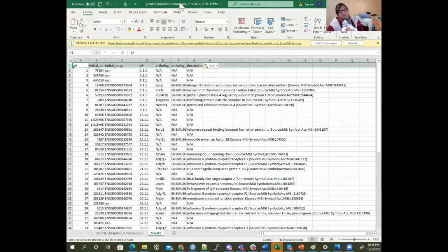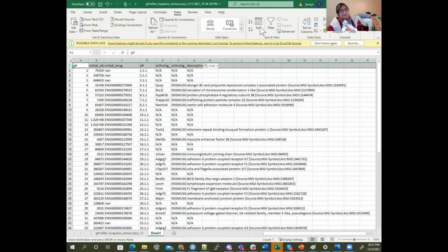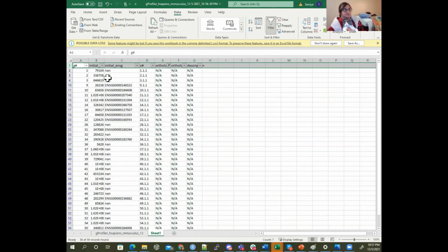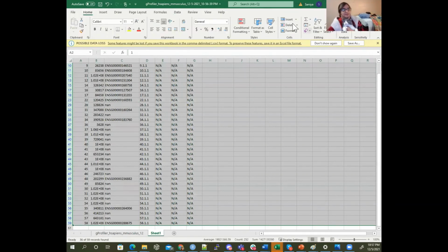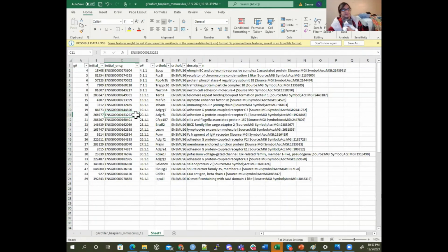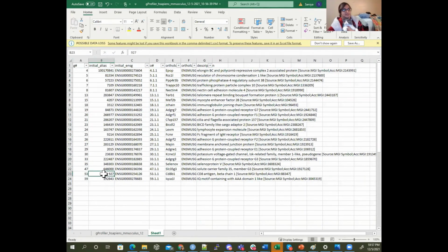So what we can do is just get rid of all of those that had NA here that did not map in the end. Those that had NA, we're just going to remove those. And let's see how many of those mapped. And we might want to see as well, these are the aliases. There might be some overlap here.